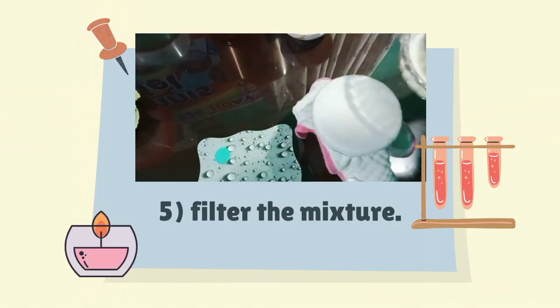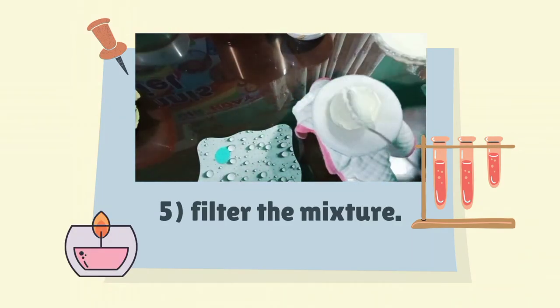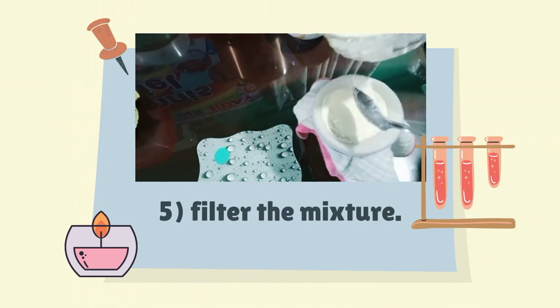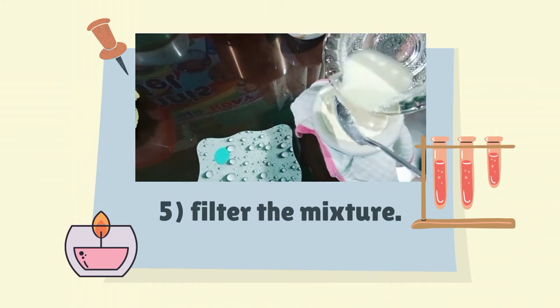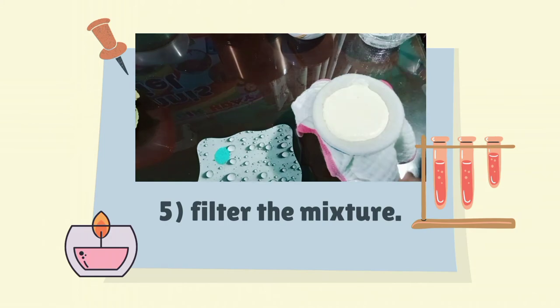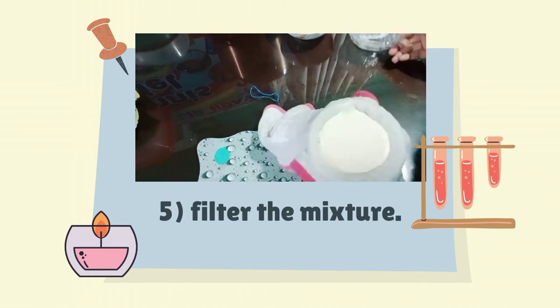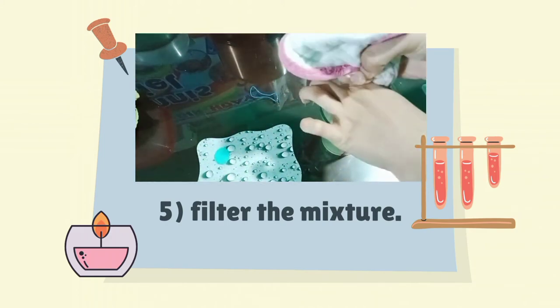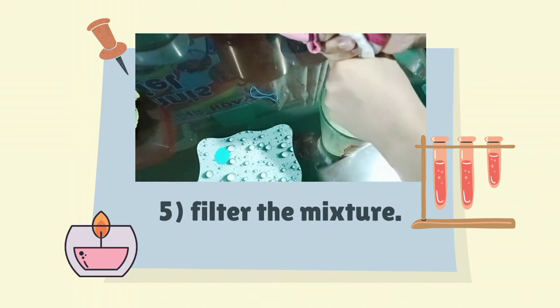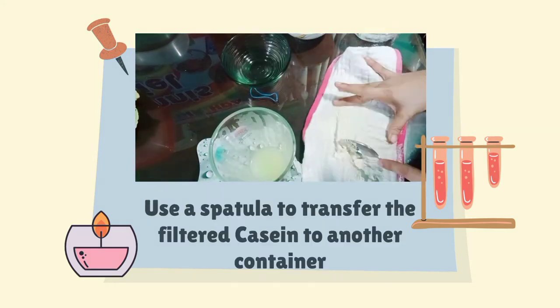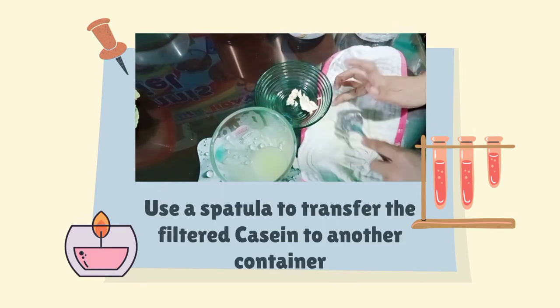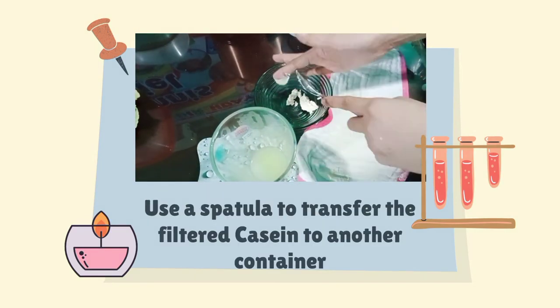Fifth, filter the mixture into a cup by pouring it through a cheesecloth or handkerchief, which is fastened with a rubber band over the mouth of the glass. Collect the precipitate by squeezing the cloth gently. The liquid filtrate contains fats and must be discarded. Use the spatula to transfer the filtered casein to another container.